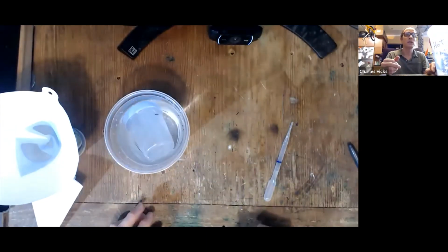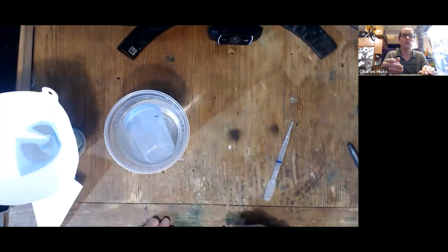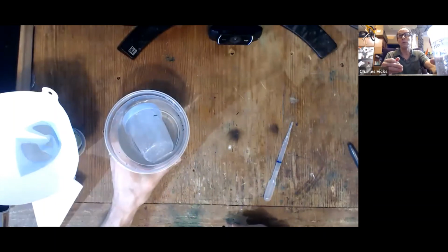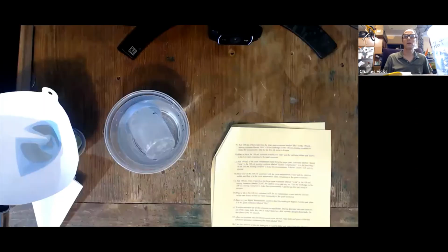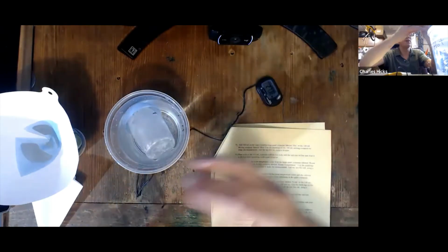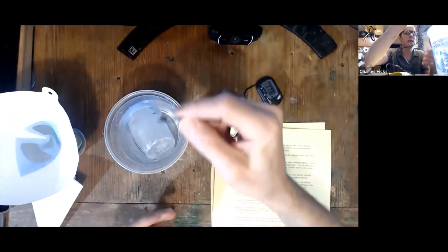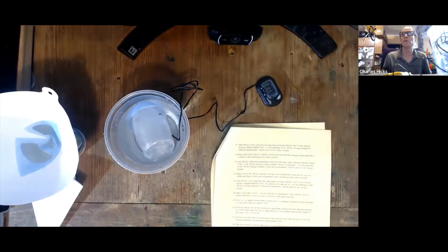Okay. And you can set a timer. We want to let it sit for at least 2 minutes. Longer is okay. A little bit longer is okay. We don't want the water to cool down too much, but around 2 minutes or a little bit more. And we're going to measure the temperature over in the funnel, but we'd like to get the thermometer up to close to the temperature it's going to be at. So you can put your thermometer into this hot water bath while that 2 minutes goes by.